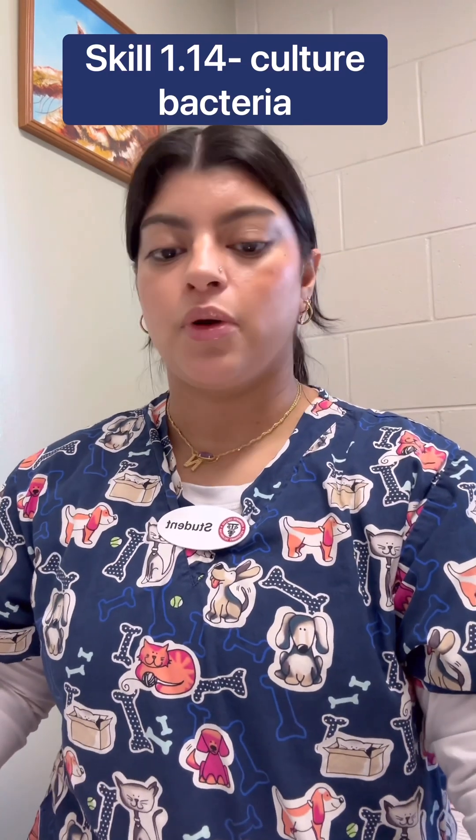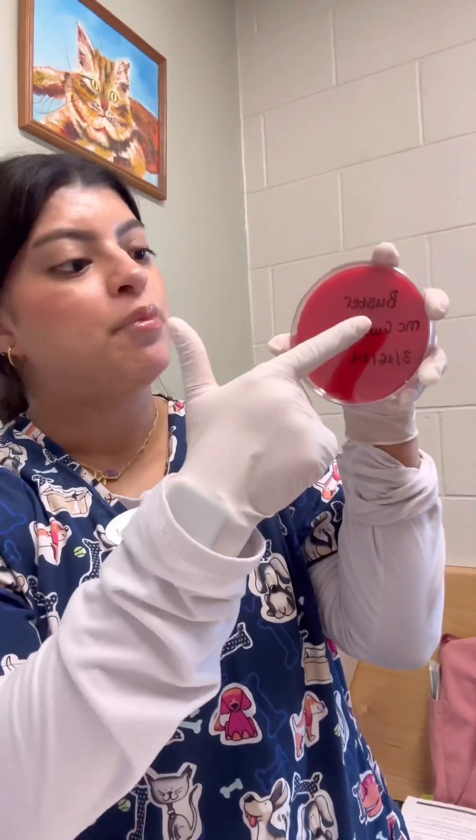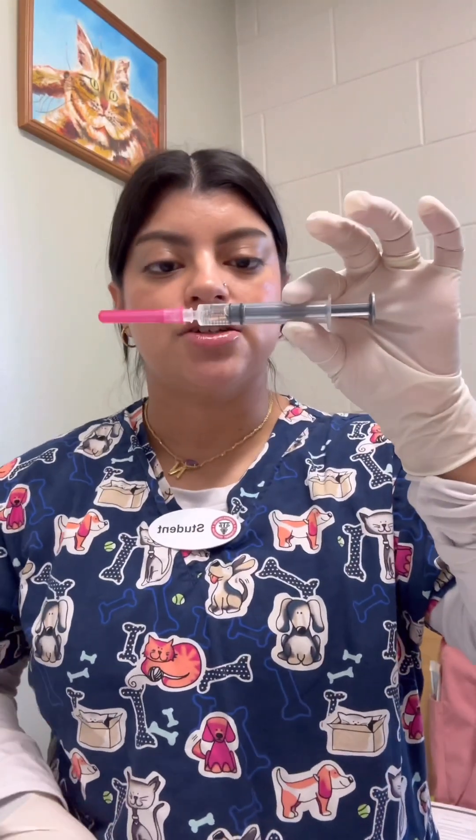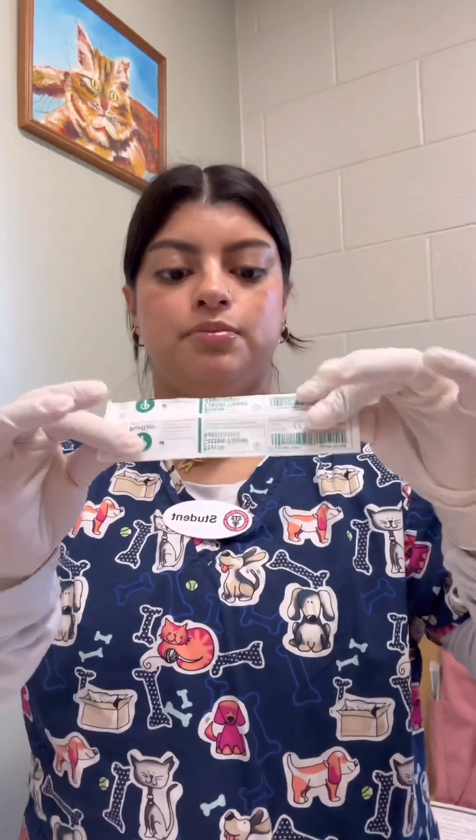In this video I'm going to be showing how to culture bacteria and perform a direct sensitivity test. I'm going to be using a Mueller Hinton Agar plate. I have my patient's name and then the date. I have a urine sample that was collected from Cystocentesis this morning and I have a sterile swab.